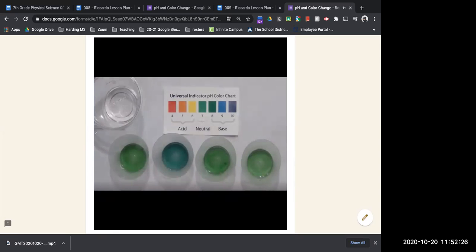What is the pH after 1 drop of this weak sodium carbonate solution is added? Another portion of sodium carbonate is added to the water, and 1 drop of this stronger sodium carbonate solution is added to the universal indicator. What is the pH in the third cup with a stronger version of sodium carbonate solution added?